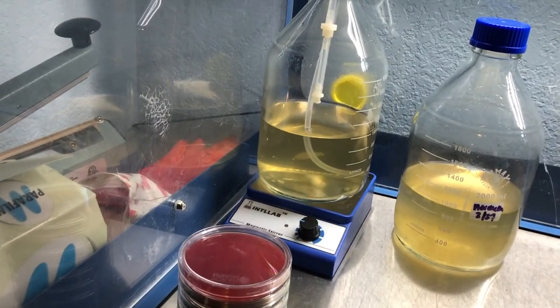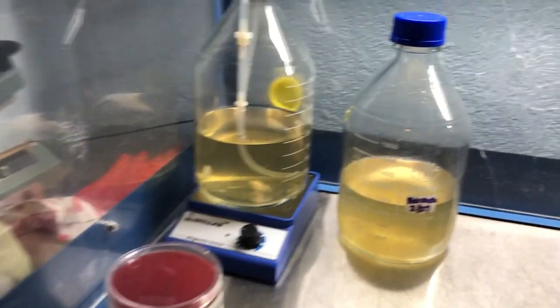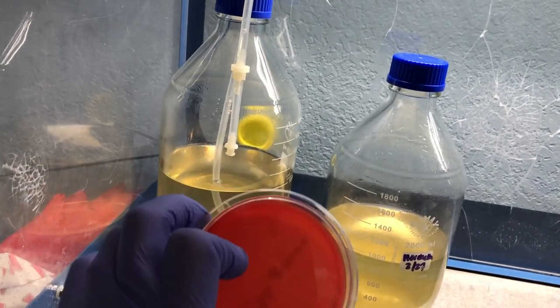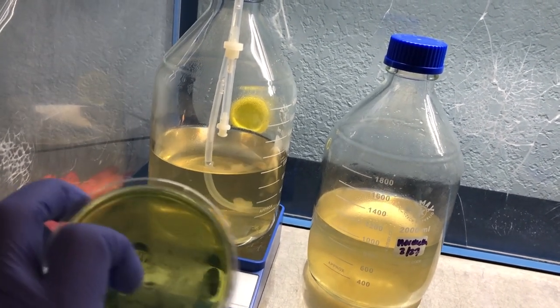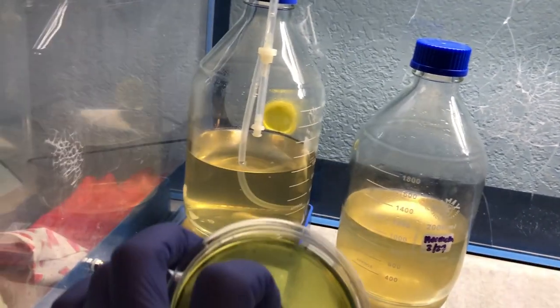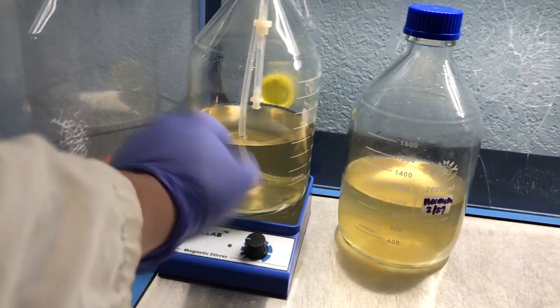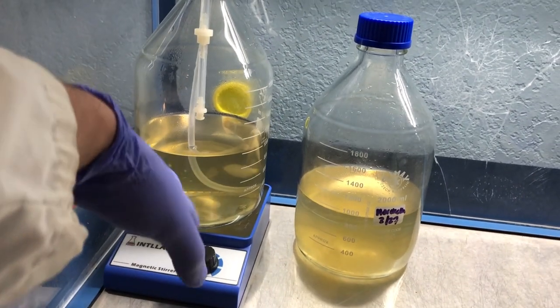Okay guys, so it's been about 56 hours since I inoculated my cordyceps liquid culture, and I've got my blood agar plate to test for bacteria, and then I've got my HE hektoen agar plate for Salmonella and E. coli. So this is what I'm going to QC my cordyceps liquid culture with. No sense in inoculating a bunch of grain if this comes out with anything.